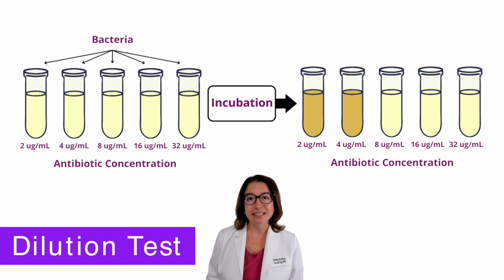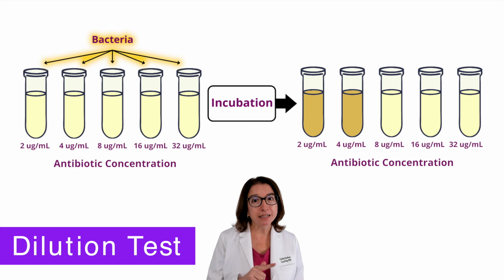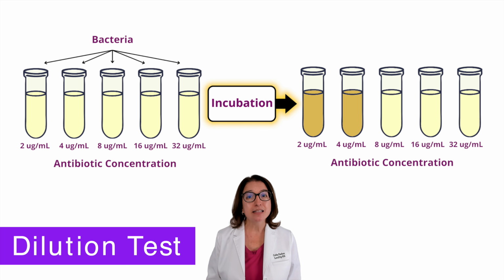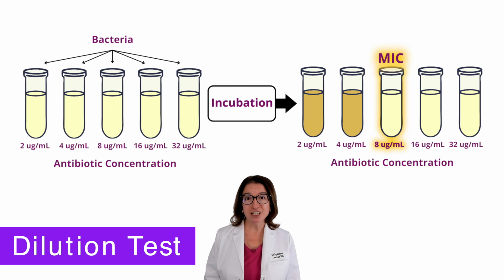To determine MIC, decreasing concentrations of the drug are placed in test tubes, and then the same amount of bacteria is placed in each tube. The tubes are then incubated and then assessed for turbidity, which indicates bacterial growth is present. So as you can see in this example, the lower concentrations of the drug, including the 2 and 4 micrograms per milliliter concentrations, did not inhibit bacterial growth. So in this example, the minimal inhibitory concentration is 8 micrograms per milliliter.